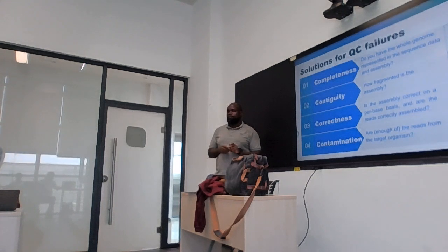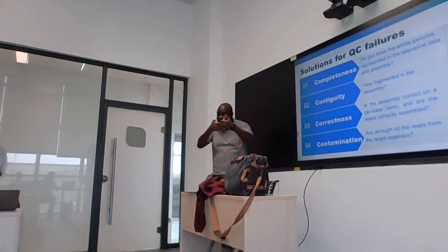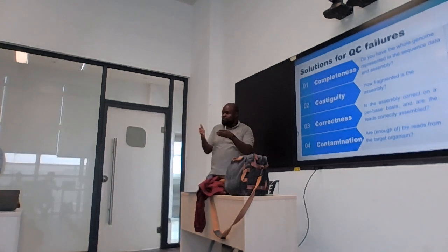Another strategy is your machines. It's the same thing we do in the lab. Like, if you're working with RSV, after, you have to clean your pipettes, right? So that the next person who is working with bacteria does their work clean, right? Then they also have to clean their pipettes. So it's the same with machines. After you do a run, you do a post-run wash, clean everything. So there's also another, Illumina now has multiple sets of barcodes. So if you use set A on this one, in the next one you can use B, just to try and avoid the carryover.